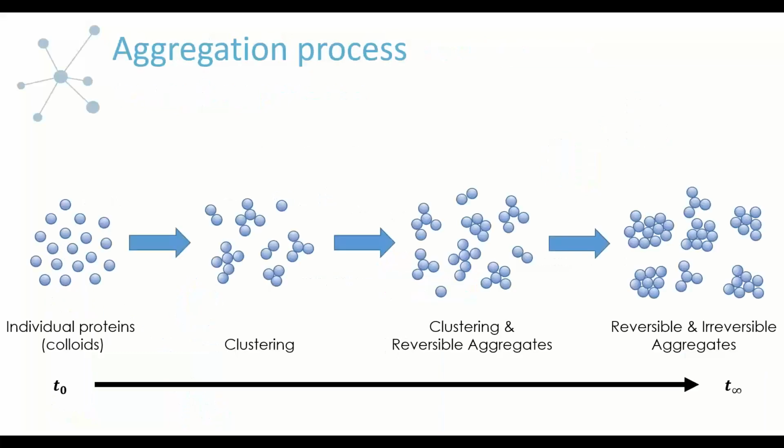And so next, I have a pretty cartoon of the aggregation process for people who like pictures, like me. So we have T naught, the initial time point where we've mixed our formulation, all the proteins are separated, distanced out, not interacting. And then we look as time increases to T infinity or T long time, long in the future. It can be years, decades, or it can be hours, seconds. But this is just a simplified speculative cartoon of what's going on in our formulations as they age.